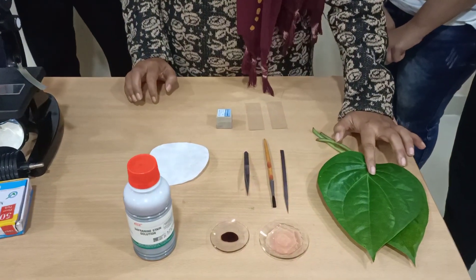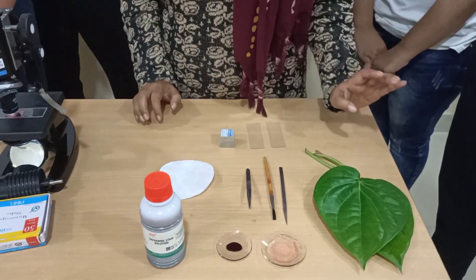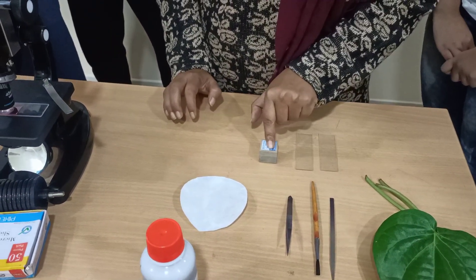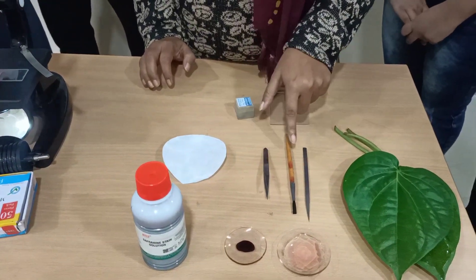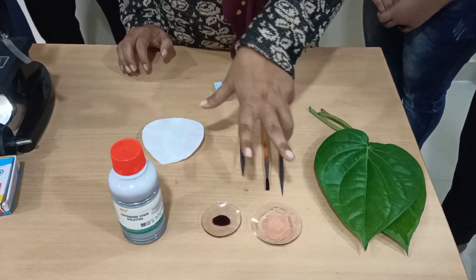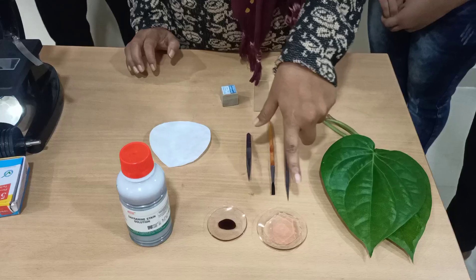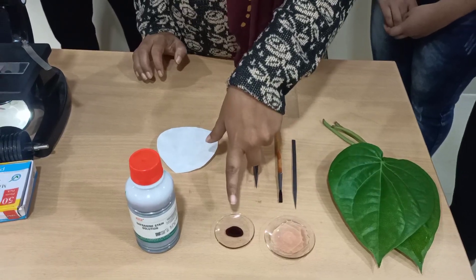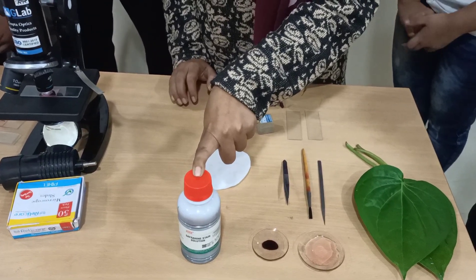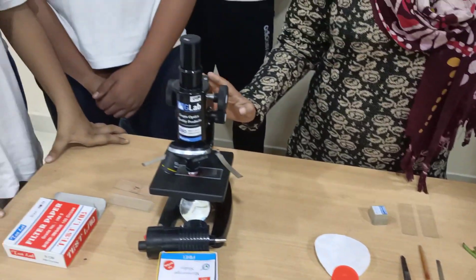First we have taken a bitter leaf, which all of you are familiar with. Then we have taken slides, cover slips, forceps, brush, spatula, and two watch glasses — one for keeping plain water and one for the dye. We have also taken safranin, which will help you to stain the stomatal cells. And obviously we have our microscope.